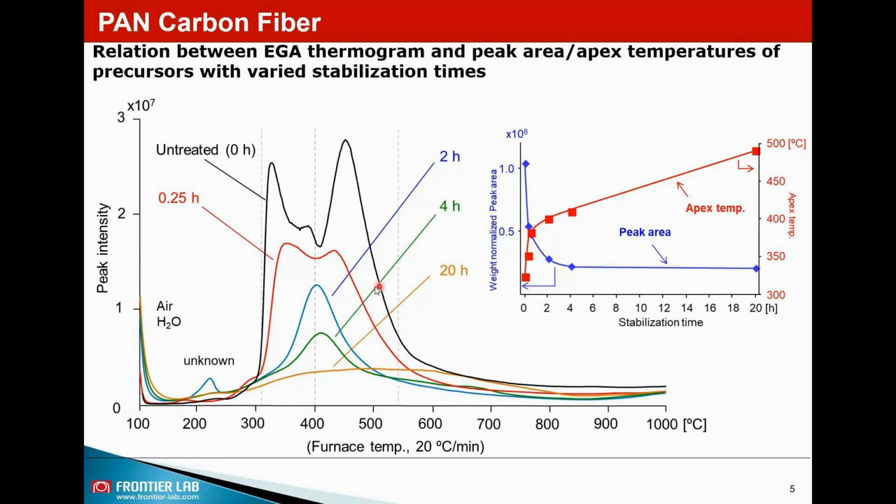In the thermogram, the untreated sample shows two kinds of peaks, which get reduced during stabilization, and from 2 hours onwards it appears as a single peak.